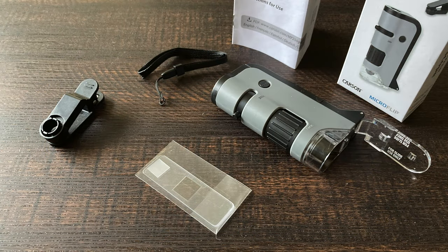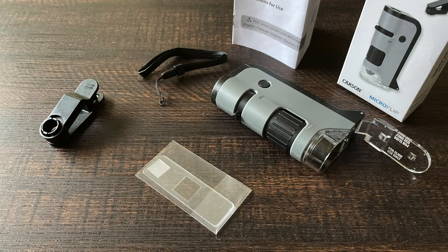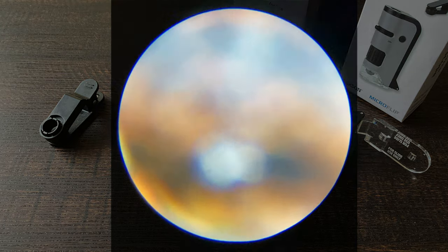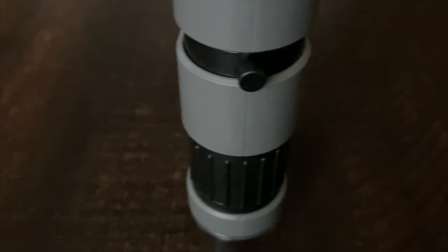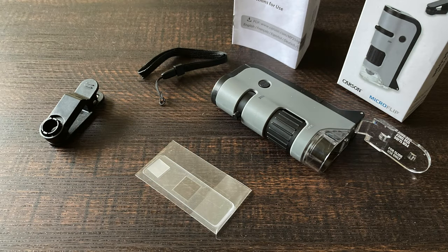While 250x optical zoom might not seem like a lot compared to microscopes that can zoom over a thousand times, it's enough to amplify even the slightest of movements. There's the pocket microscope — it's pretty much the main attraction. What's nice is how it's just one piece; it was really easy to set up. In fact, it already had the wrist strap attached, which I promptly removed as it would only get in the way.